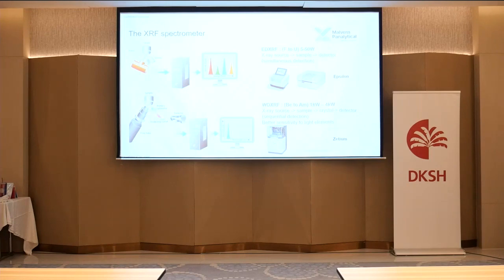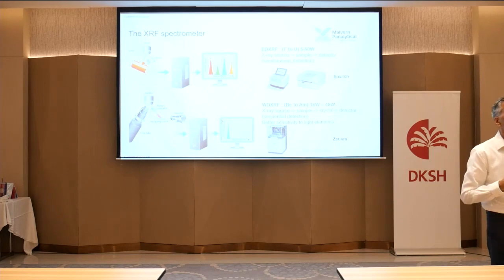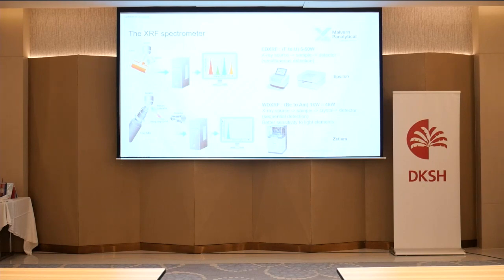The advantage of WD-XRF is that it has better sensitivity to light elements. So whenever you have light elements like sodium, aluminum, silicon, or below, particularly boron, carbon, and these kinds of light elements, then WD will always perform much better. So if light elements are very important, then you go with WD. But otherwise, if you have sodium onwards elements, then ED is good enough.